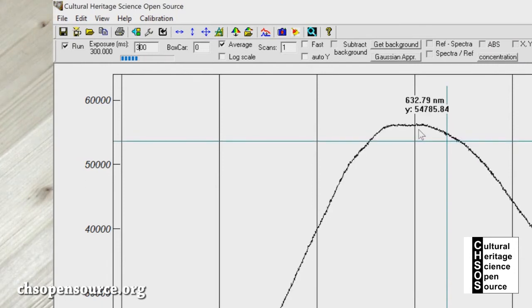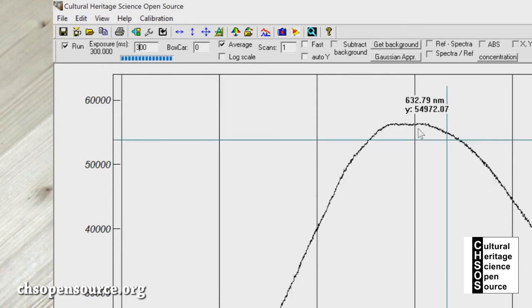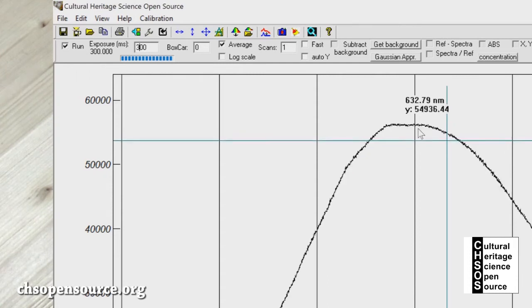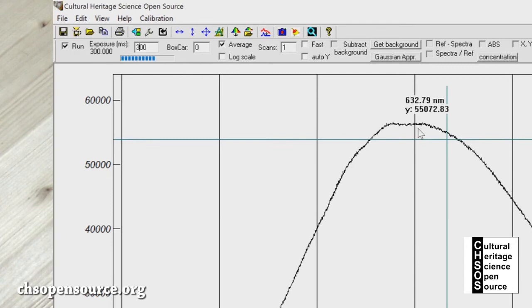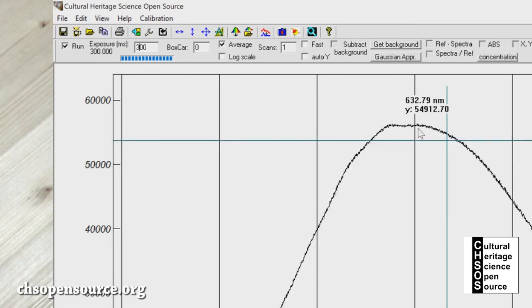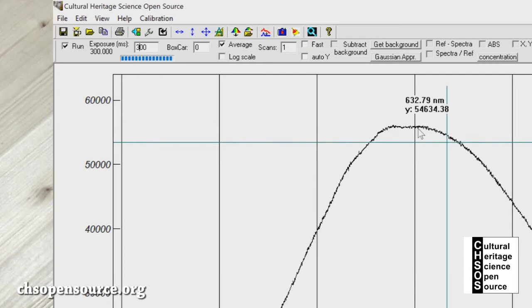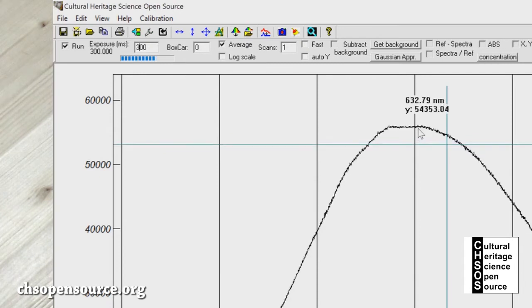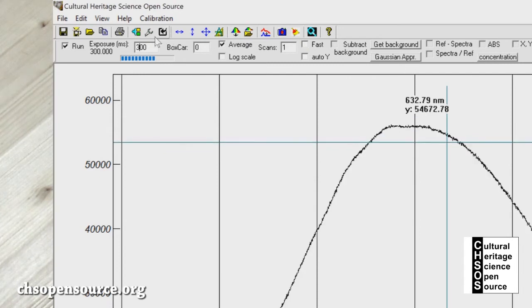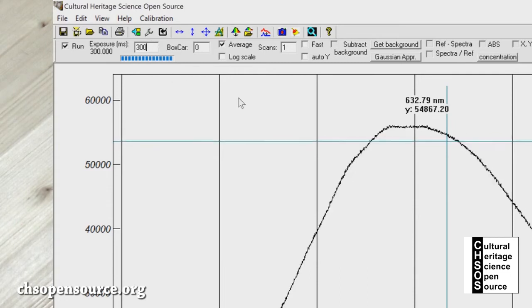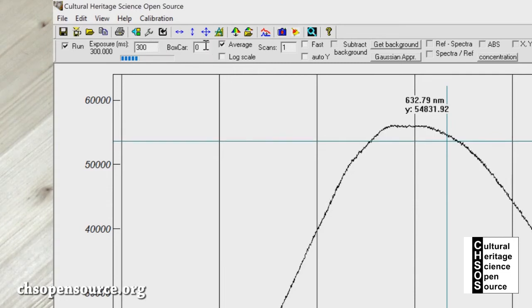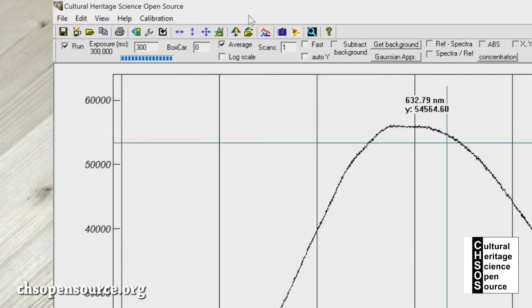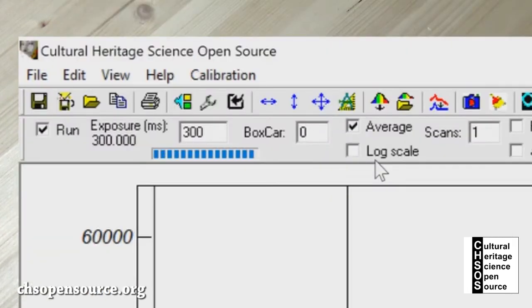We go on the software and we look at this tab, 'exposure in milliseconds'. Now the exposure is very low, it is 10 milliseconds, very fast. We need to increase it. Let's put 100. Now the curve is at 20,000. We want to reach something close to 60,000. So let's put 300.